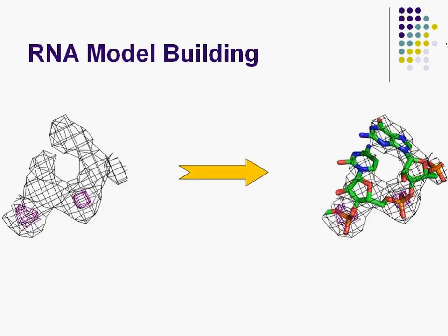Model building historically hasn't had very many good tools. A lot of it started out as you stare at the density, which is not all that specific, and you try to cram in nucleotides, or stretches of nucleotides. As I mentioned before, that is very time-consuming and very inaccurate.